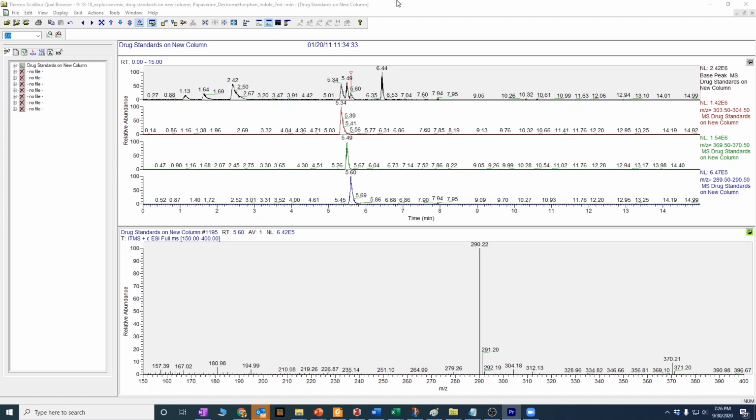You can put protons on a lot of different things in mass spectrometers, but certainly things like alkanes, aliphatic hydrocarbons, they are not going to work well at all with this type of mass spectrometer. So it tends to be that really non-polar compounds, or compounds that are mostly hydrocarbons, are not going to do very well on LCUV or LCMS.